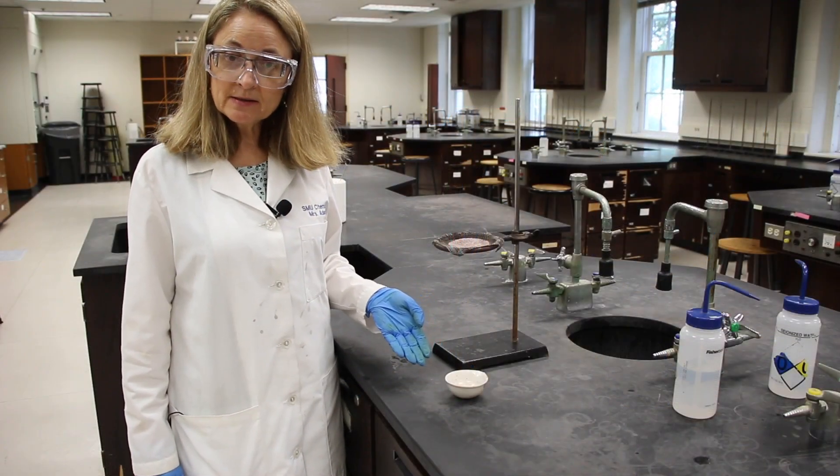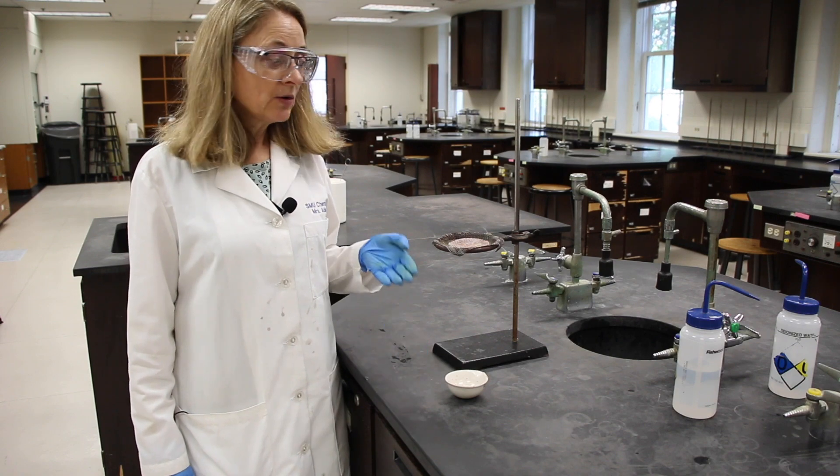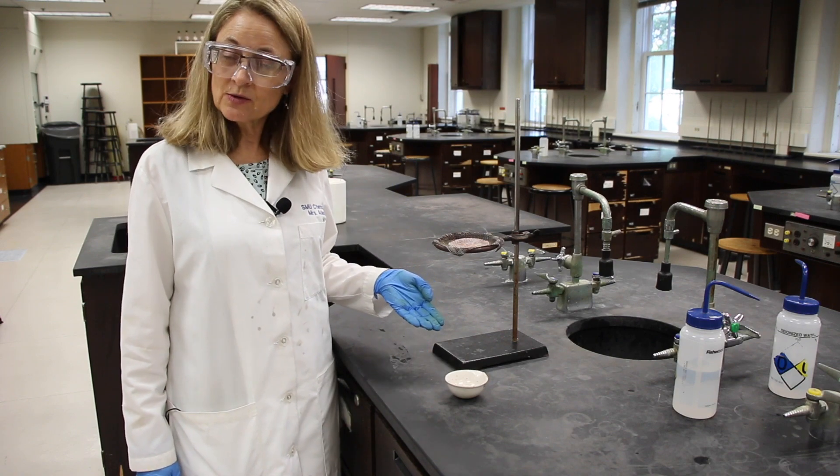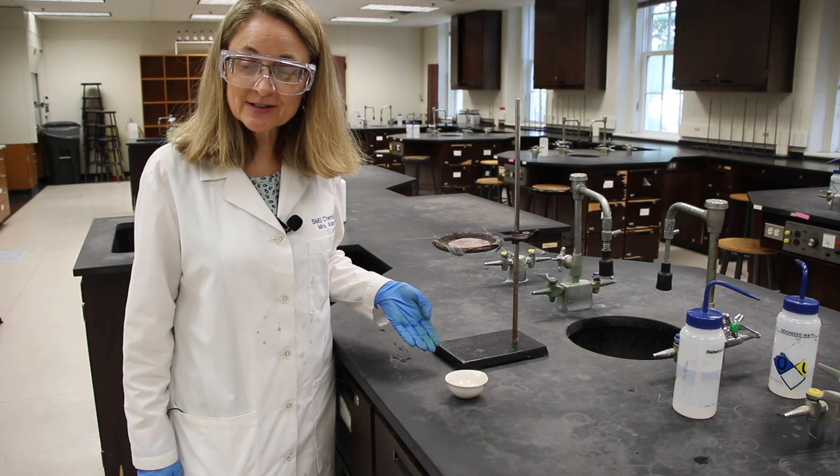Now you can calculate a percent yield and answer the error analysis questions. You can also clean up please so the next group will be ready. Thank you for being my lab partner today.